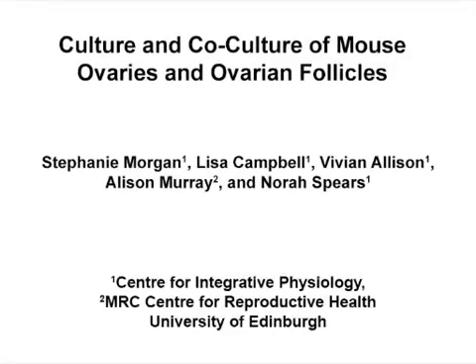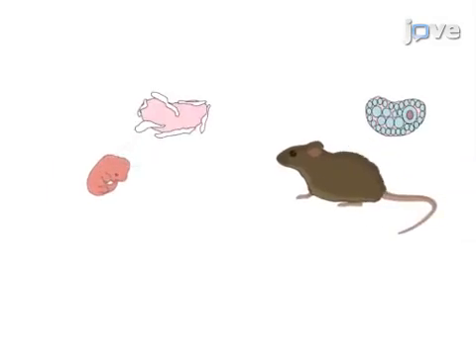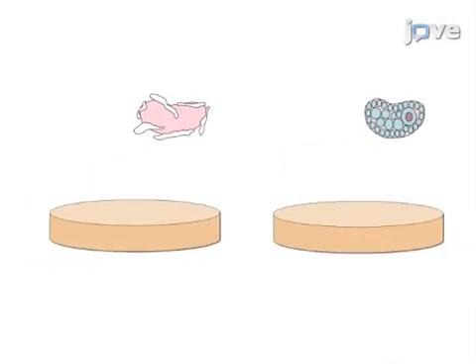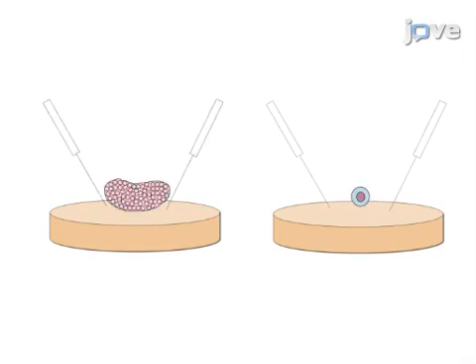The overall goal of this procedure is to grow neonatal ovaries and/or individual ovarian follicles in vitro. This is accomplished by first dissecting ovaries from cold females of the appropriate age. The second step is to prepare the tissue, including fine dissection of individual ovarian follicles with acupuncture needles.